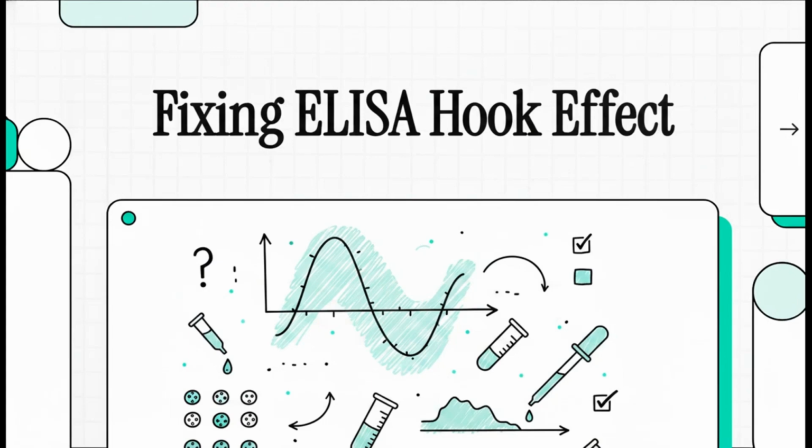Look, today we are tackling a massive, incredibly frustrating headache that literally every lab scientist knows all too well. We're talking about troubleshooting ELISA hook effects and low sensitivity. If you've ever spent days carefully prepping a run, carefully pipetting your samples, only to end up with wasted plates, wonky standard curves, and absolutely zero usable data, I completely feel your pain. I've been right there at the bench, staring at the plate reader in absolute disbelief. But today we are going to fix it.